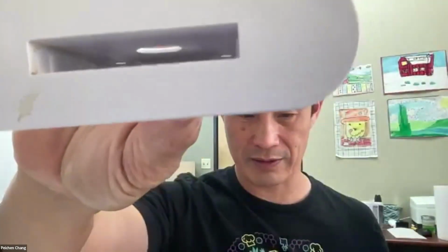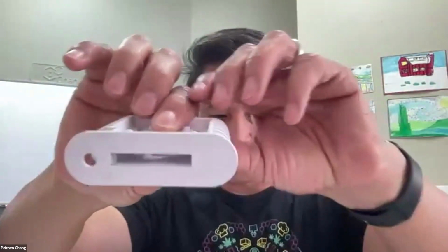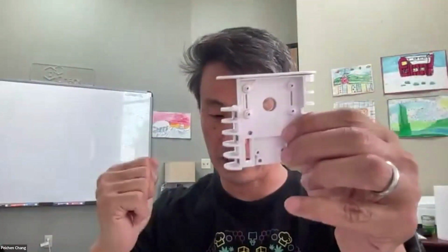So if you take apart your tCheck to try to clean it, you're going to mess up all of that z-axis pressure that we've calibrated into tCheck. And so unfortunately, no. Now if you look into the tCheck slot, sorry, this one's really dirty, you can see that there are holes in it to prevent liquids from spilling onto the electronic bits.